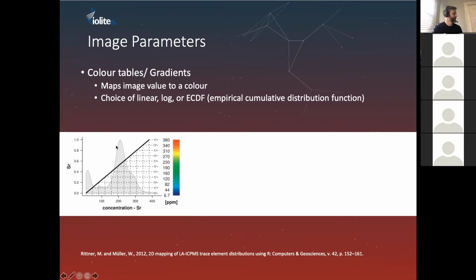But the problem with this is that from here to, let's say, this sort of shoulder region here, where we have a few outliers but not much, we probably have less than 10% of our data, we're using up all this resolution here. So from oranges right through to reds, which are basically only going to be used for a few pixels. And the same thing down here in this gap between the baselines and the main bulk of data, we're using up all of our aqua through to green values where we don't have any values at all. So we'd mostly see blues and some greens, and we wouldn't be using any of the other colors.